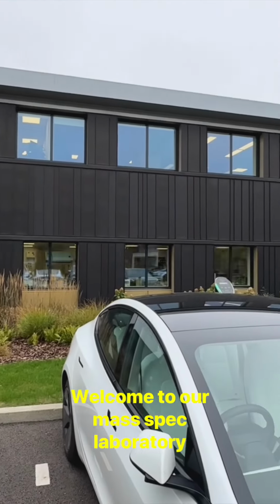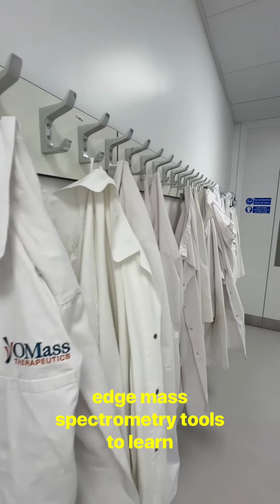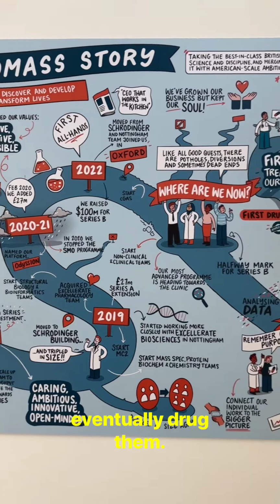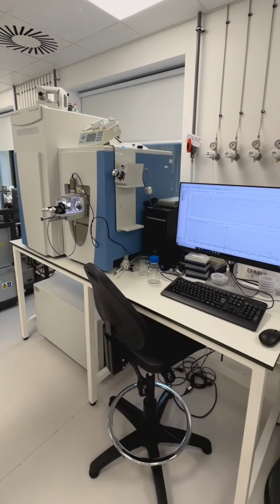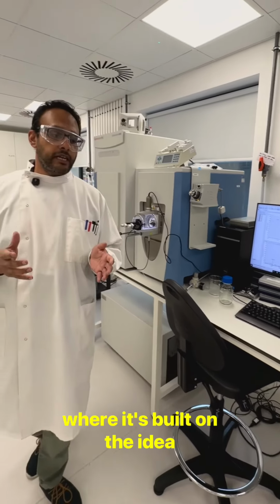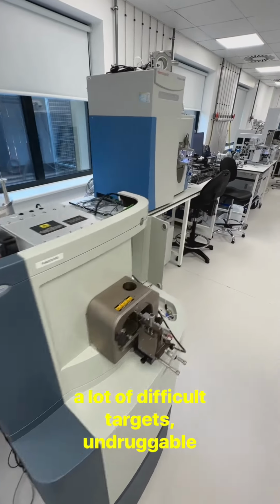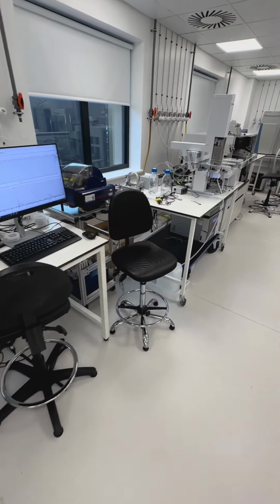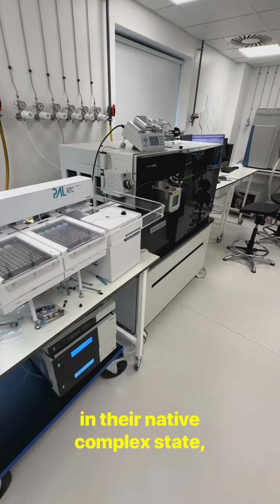Welcome to our mass spec laboratory, where we are using some of the cutting-edge structural mass spectrometry tools to learn more about our proteins and actually eventually drug them. So firstly, we have a state-of-the-art native MS mass spec instrument, built on the idea that our protein targets, where we work on a lot of difficult targets, undruggable even, we need to keep these protein targets in their native complex state.